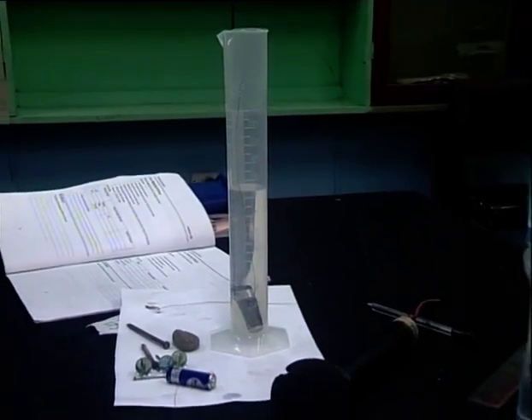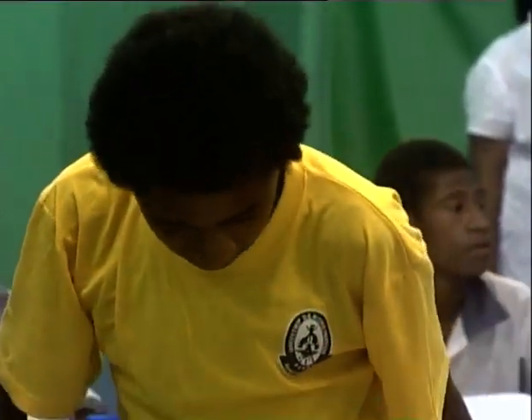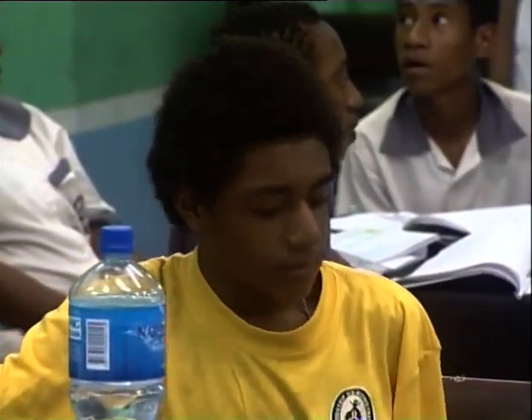So first volume that you took when you poured the water into the measuring cylinder for group 8 was, Donald, can you give us what your first reading was for your group? 149.